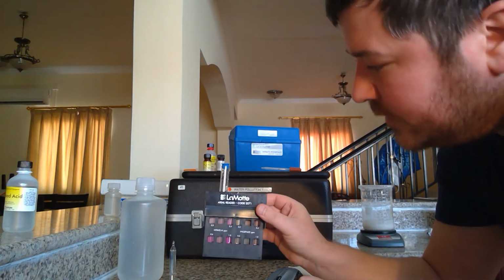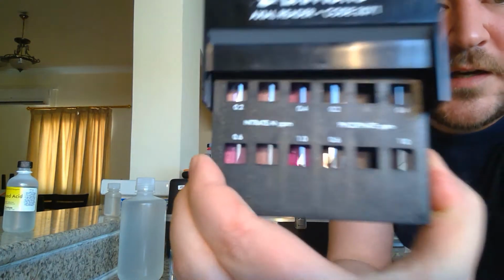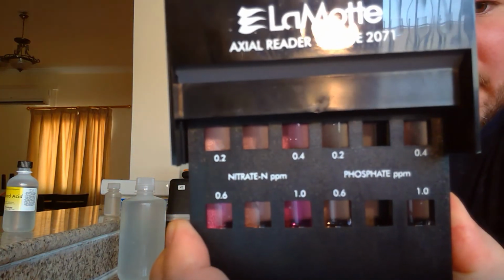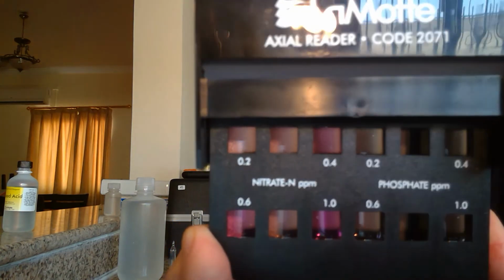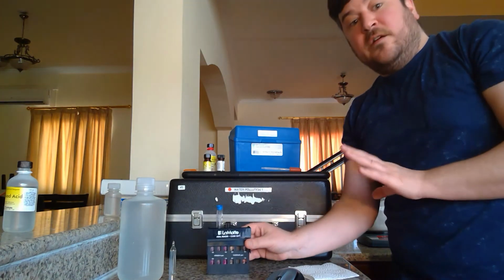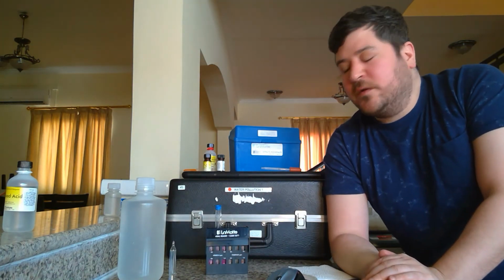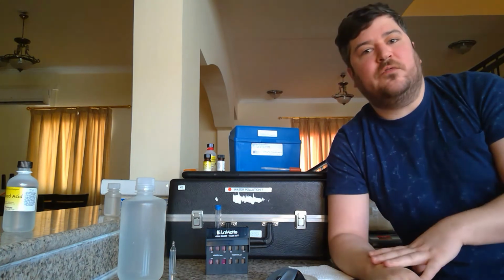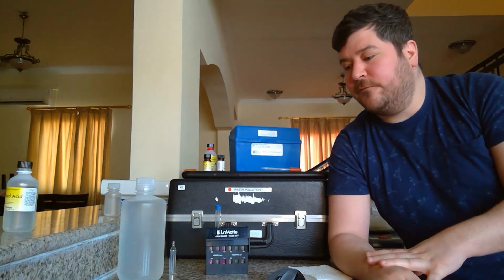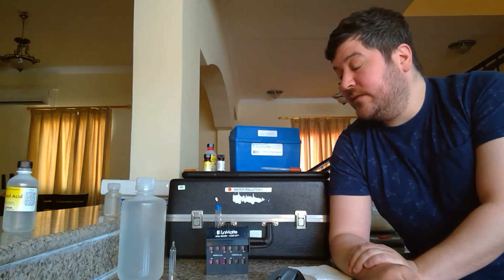I looked at this at about 5 minutes in, and I thought it was less than 0.2. But looking at the colors now, it is definitely matching that 0.2 on this reader. So the reader is saying 0.2. The lab instructions say now take this result and multiply it by 4.4, and you will get your parts per million of nitrate in the sample.